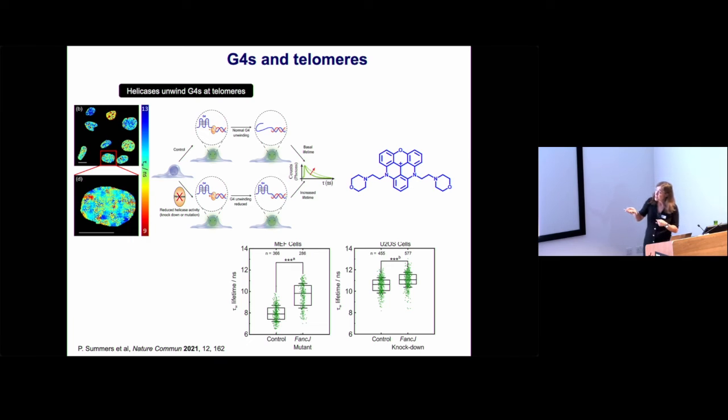So the consequence of this is no helicases are now existing in the cells. And so quadruplexes are not going to be unwound. There'll be more quadruplexes, and so the longer lifetime is observed. And that's exactly what we see in our delta M2 experiments. So our experiments, again, confirm the function of helicases such as FANCJ or RTEL in cells. And we can do FANCJ mutants and knockdowns, RTEL mutants and knockdowns, and then even produce a mutant that doesn't have either of these two helicases, and then have an additive effect of increasing lifetime.